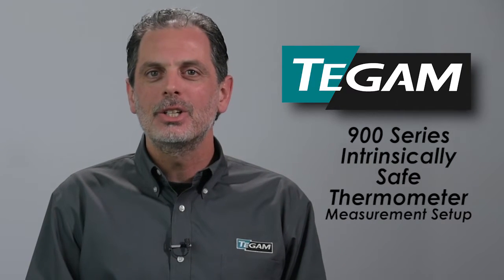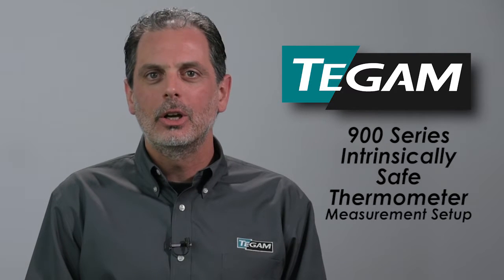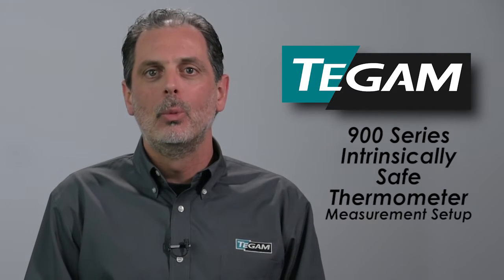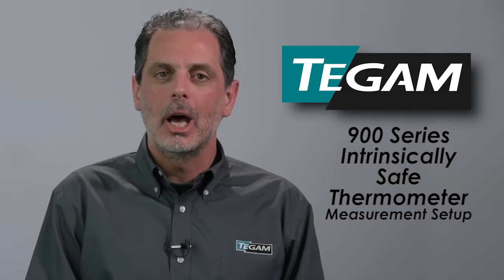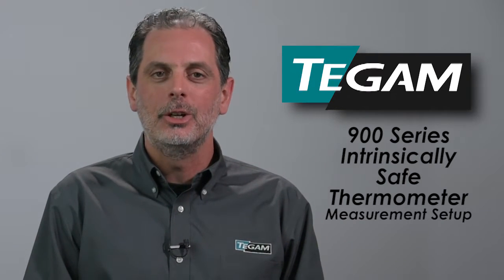That's all. You're now ready to take a temperature measurement. Please take a look at our other videos in this series to learn more about all the features of TEGAM's 900 series thermocouple thermometers. Thank you.